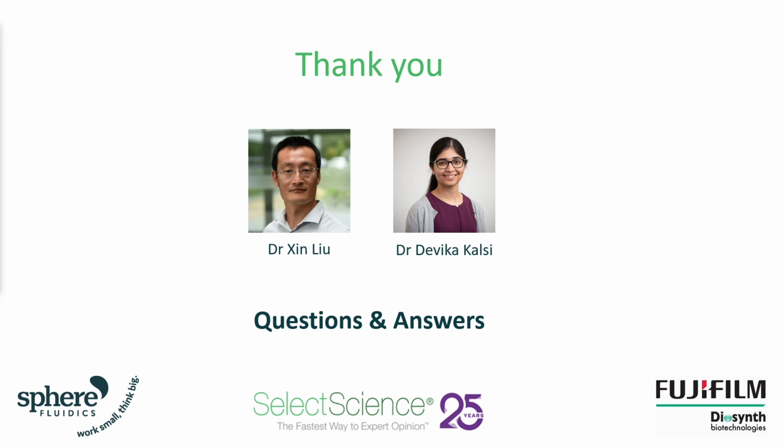Thank you, Xin. Are you employing any advanced analytics during screening to interrogate product quality attributes such as glycan profile and other PTMs? Does this factor into your selection criteria in addition to titer? I think that one's for me. Within Apollo X, we do evaluate the product quality at the AMBER 15 stage. We use analytics to look at the glycan profiles and things like high molecular and low molecular weight species, to check the purity of the product and compare it against the standard for that molecule. We do take that into account when selecting at the end of the cell line development process.